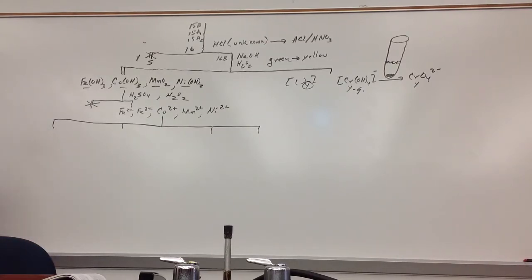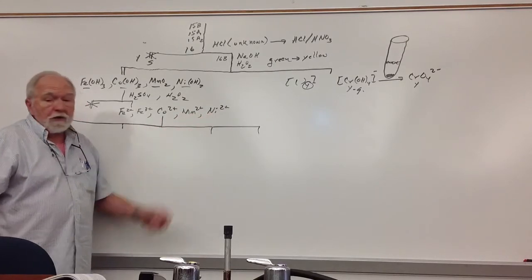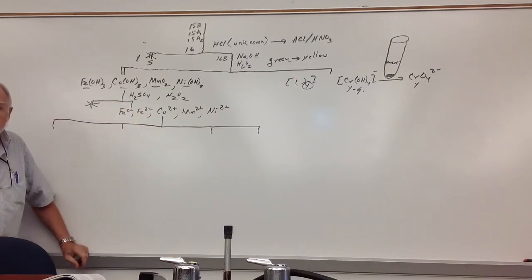For the nickel, you're just going to do a separate test. I talked about the specific precipitating agent, dimethylglyoxime, and it makes a unique precipitate. The only thing I said is when you calculate the drops of nickel, you use the usual formula and divide by 4, just so it corresponds to what you did here, where you divided the solution into 4 equal parts.